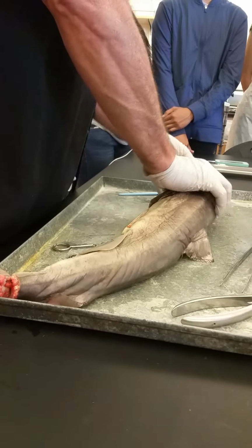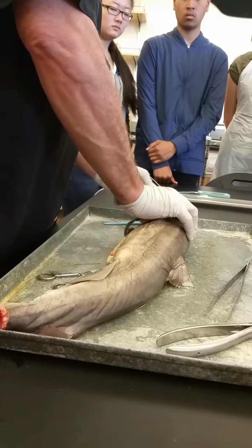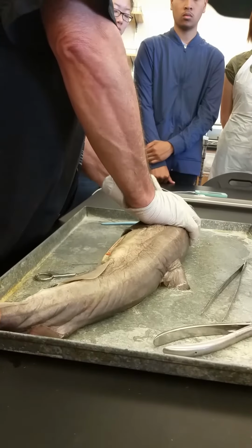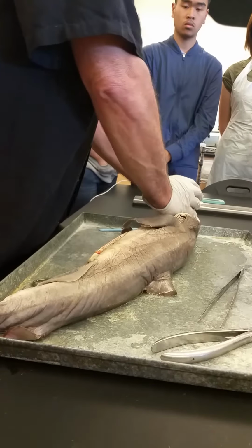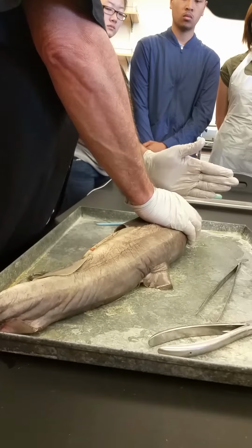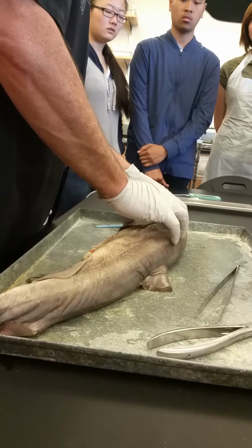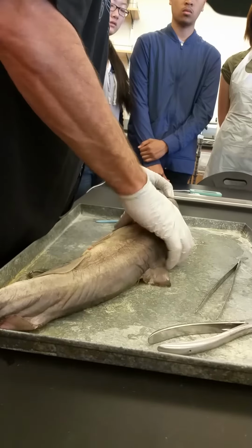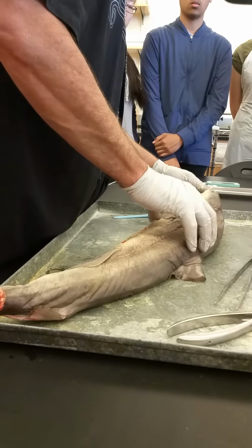And for a long time, people thought that meant that sharks had to turn upside down in order to bite anything. But it turns out that they actually have the ability to lift their nose up and project their mouth out. So it's a projectile mouth, they can just lift their snout out of the way, the jaw shoots forward, and grabs whatever it is they're feeding on. It's pretty interesting. I've fed sharks, and watching them do that is pretty interesting.